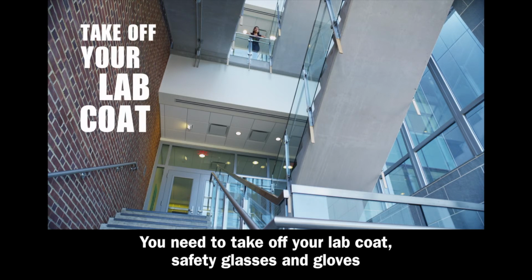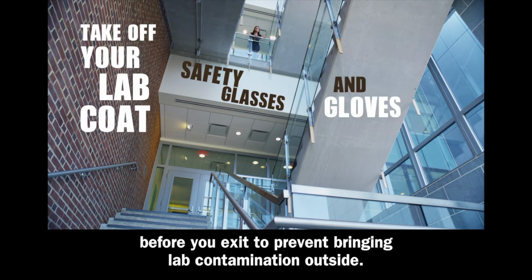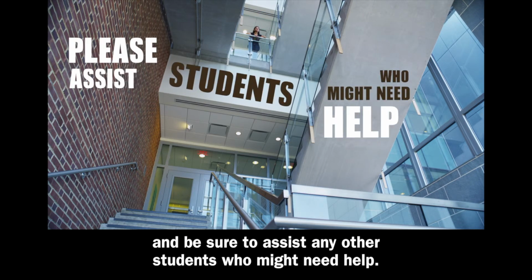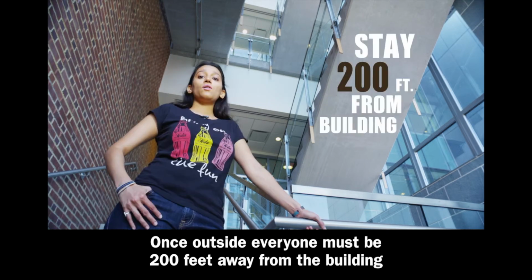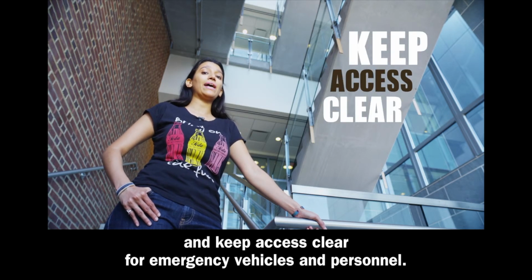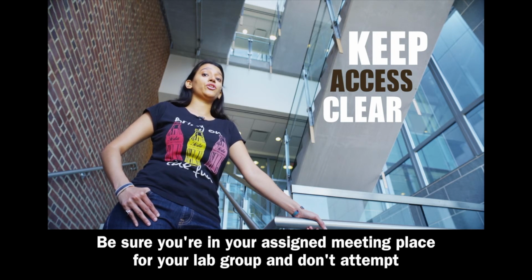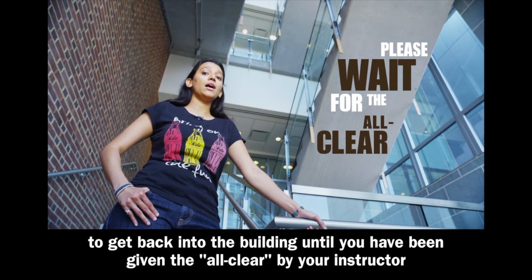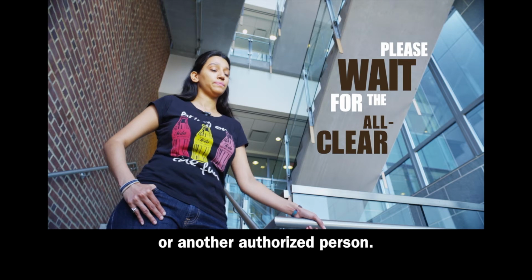You need to take off your lab coat, safety glasses and gloves before you exit to prevent bringing lab contamination outside. As you exit, don't use the elevator, only use the stairs, and be sure to assist any other students who might need help. Once outside, everybody must be 200 feet away from the building and keep access clear for emergency vehicle and personnel. Be sure you're in your assigned meeting place for your lab group and don't attempt to get back into the building until you have been given the all clear by your instructor or another authorized person.